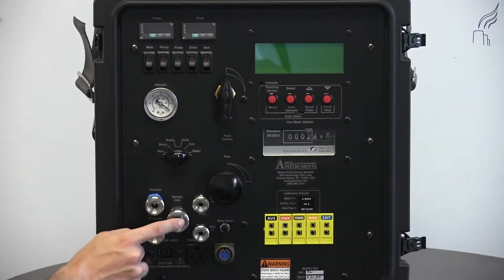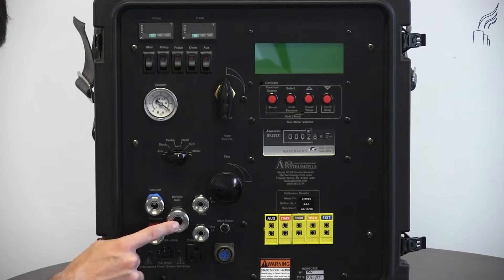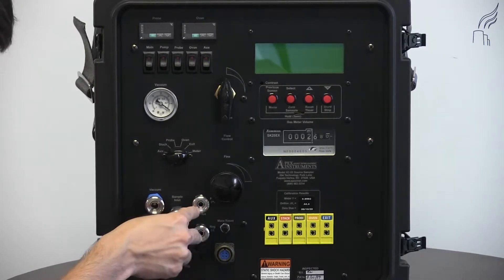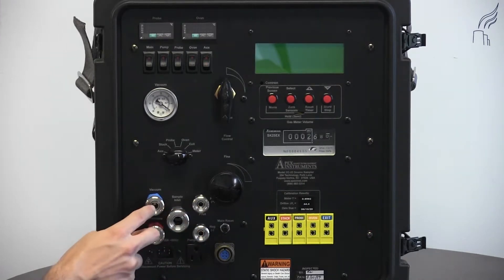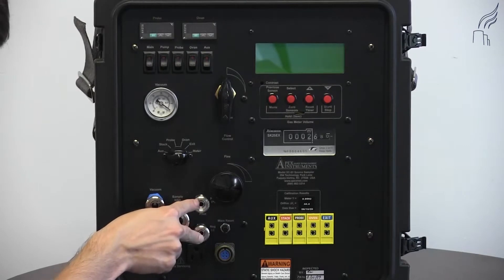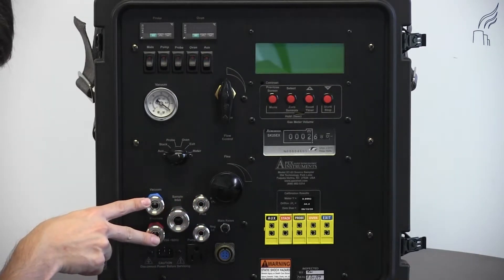Beside this, we have our sample inlet and our quick connects for our positive and negative pitot lines. On models without the optional booster pump quick connects, the pitots would be in the place of them.